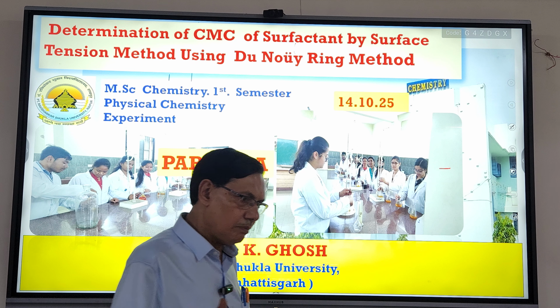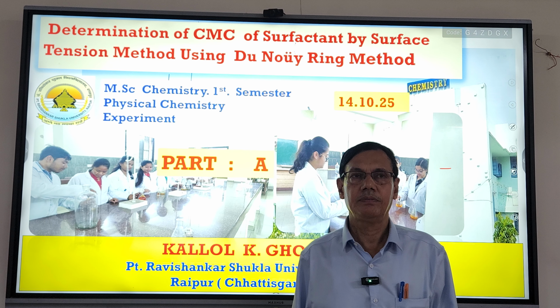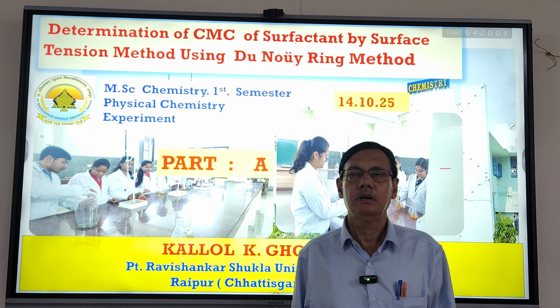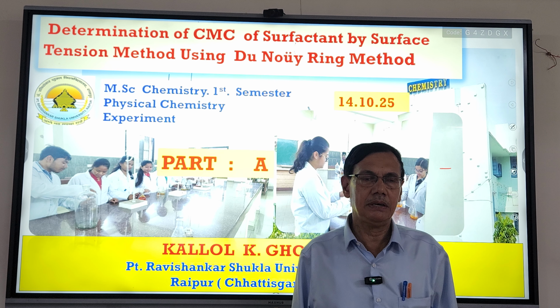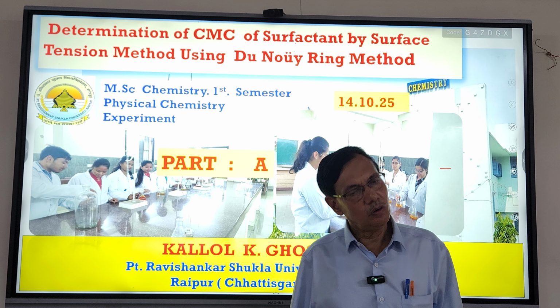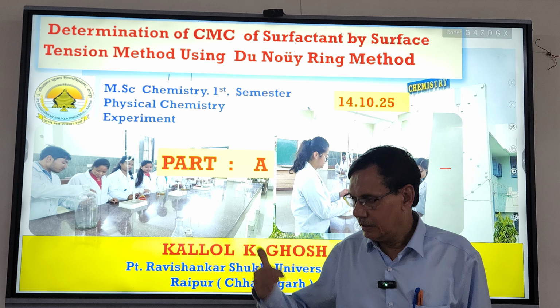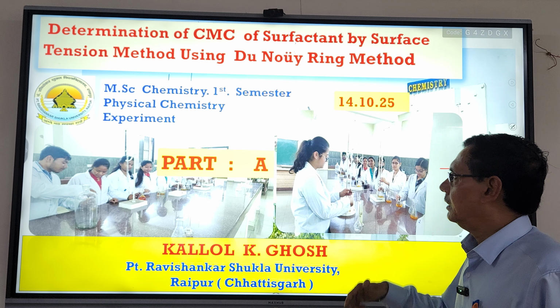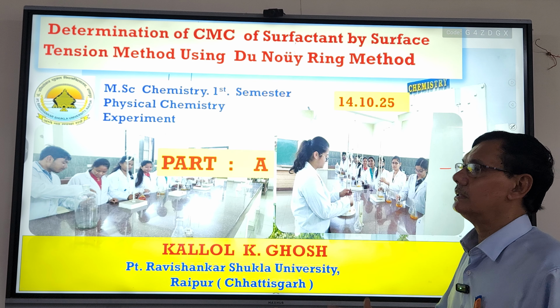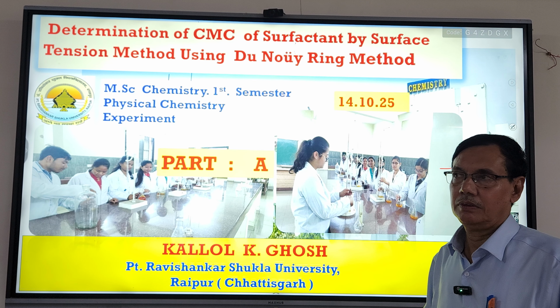Now you know that there are many methods available for the determination of CMC. In most of the MSc classes, we measure conductance, or sometimes we measure the surface tension. Here we will measure the surface tension by the Du Noüy ring method.